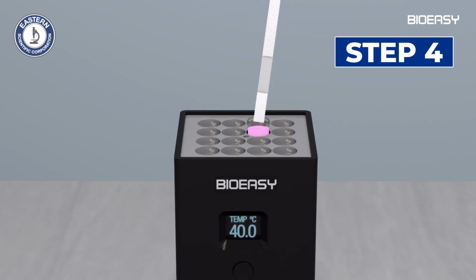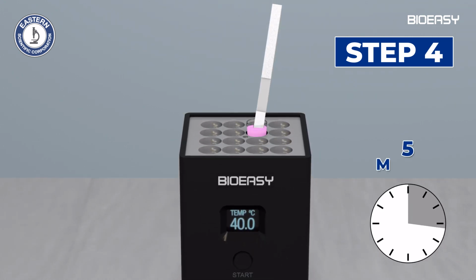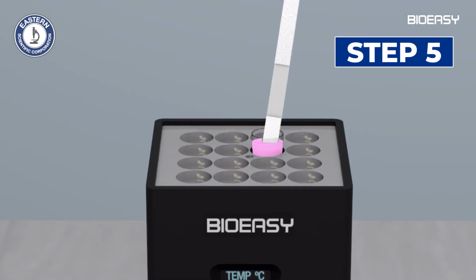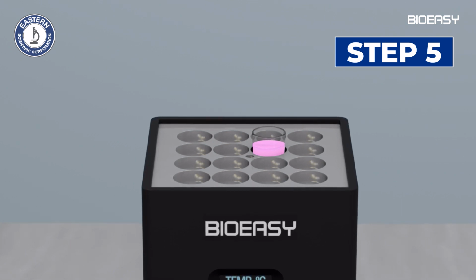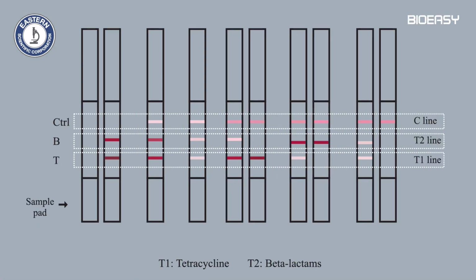Step 4. Insert the dipstick into the microwell after first incubation. Incubate another 5 minutes at 40 degrees Celsius. Step 5. Take out the dipstick from the microwell and remove the sample pad at the lower end and interpret the result. Compare the color intensity of test line or T line and control line or C line and interpret the test based on chart.